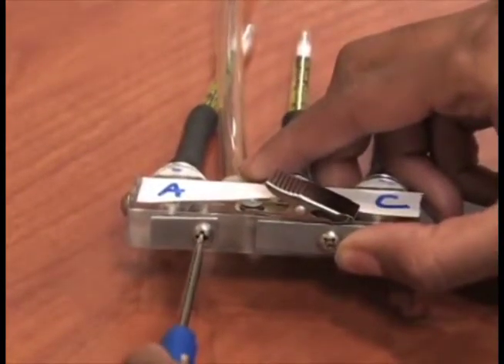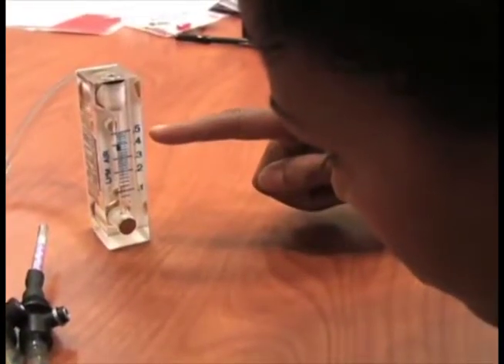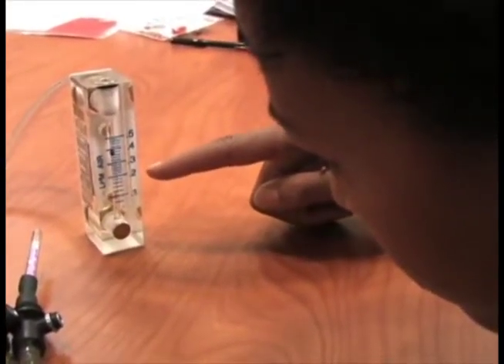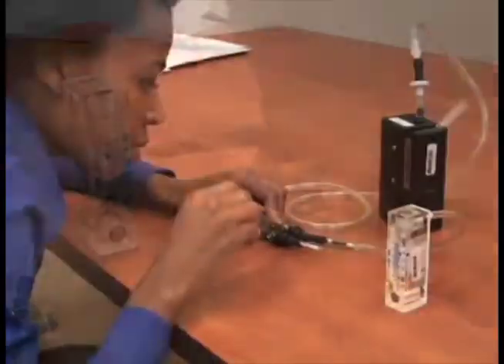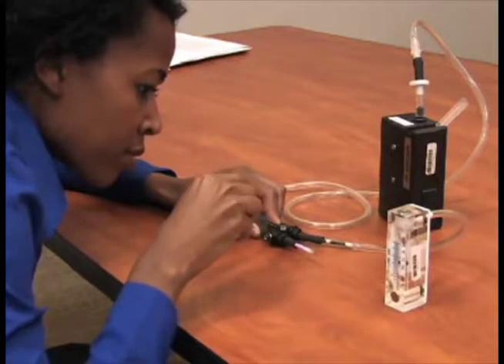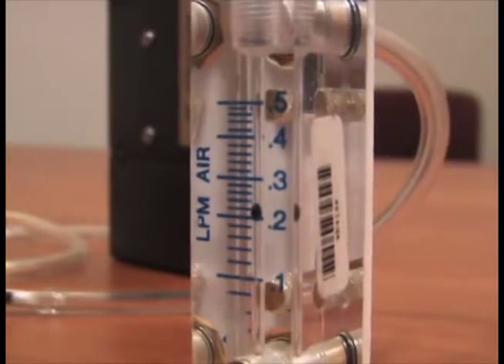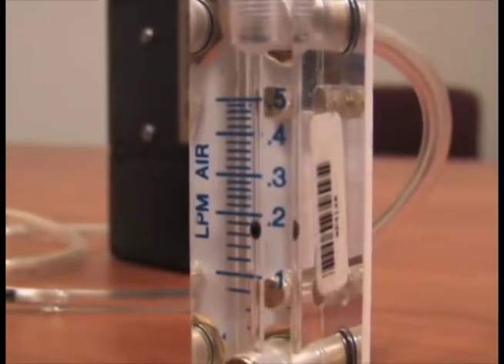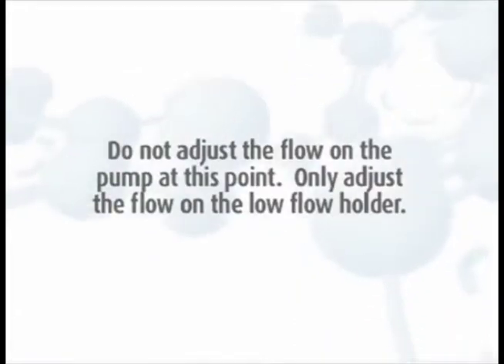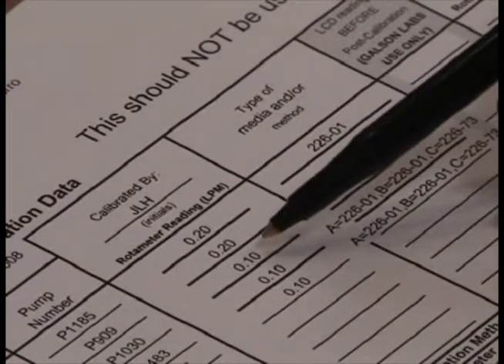To adjust the flow rates on the triple splitter for the port you are calibrating, loosen the screw on the bottom of the splitter to reveal the port's calibration set screw. With everything sitting on a level flat surface, check the ball float in the rotometer. Adjust the flow rate by turning the flow adjustment screw on the adjustable low flow holder until the rotometer indicates the desired flow. Be sure to take your rotometer reading at eye level and use the center of the float for the value. Do not adjust the flow on the pump at this point — only adjust the flow on the low flow holder.